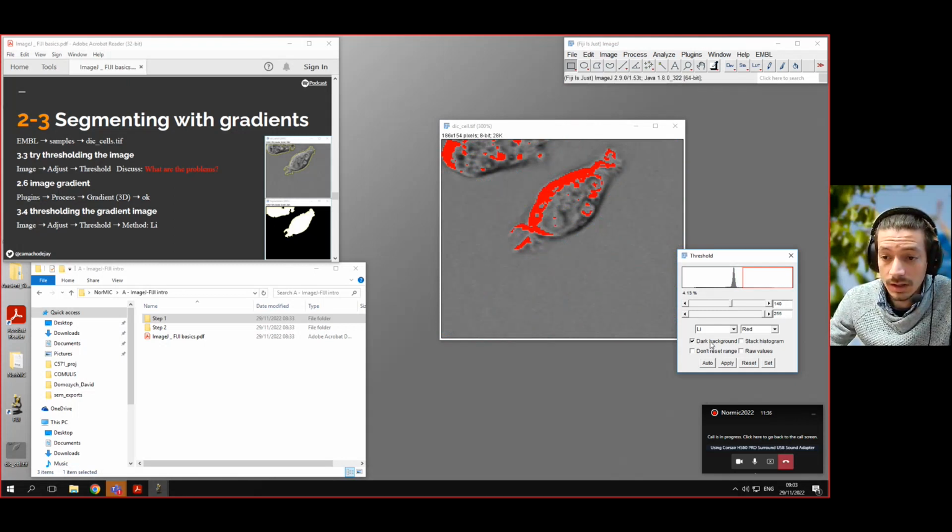And if I were to say, okay, this is the opposite, then you will also end up in similar situations where if I segment from the opposite, the shadows, then I don't manage to catch the upper parts, right? So this is going to be very annoying to fix up.